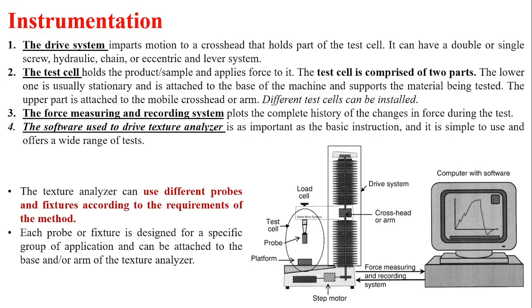For different samples and for different applications, different kinds of probes are used. Each probe or fixture is designed for a specific group of applications and can be attached to the base and arm of the texture analyzer.